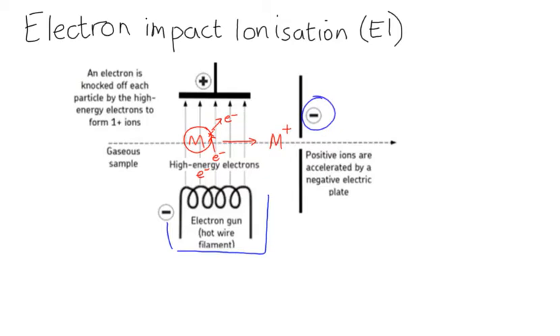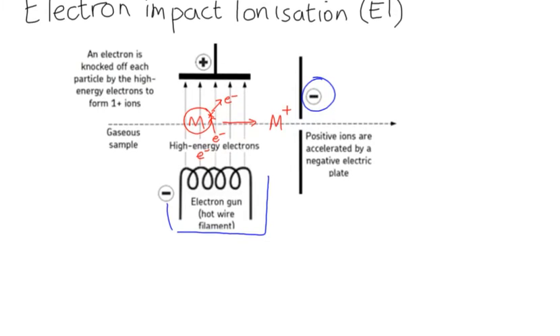So electron impact is we're going to take our sample. If we were putting an element in here, so for example we put some sodium element in, as it moves through the machine, at this point it gets banged into by an electron from the electron gun, and it becomes a positively charged ion, and an electron is lost, and that is called ionisation. I have made a positively charged ion from my element.